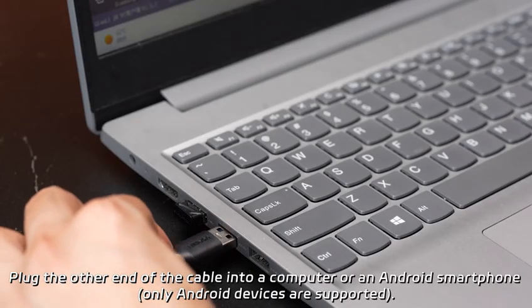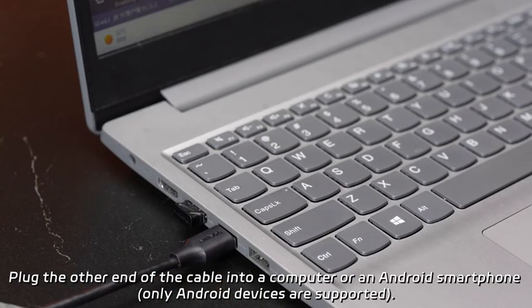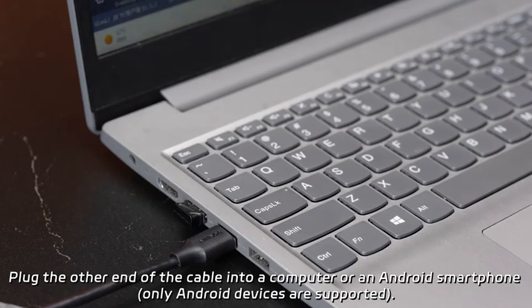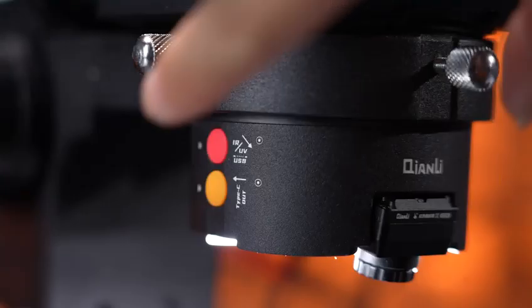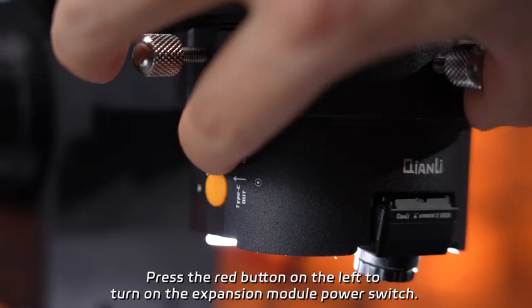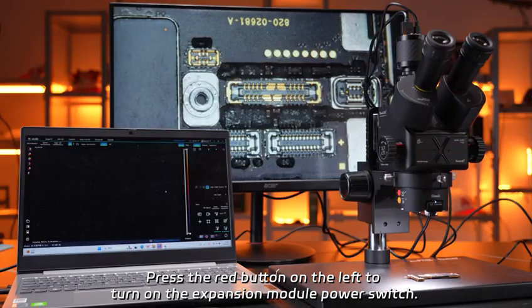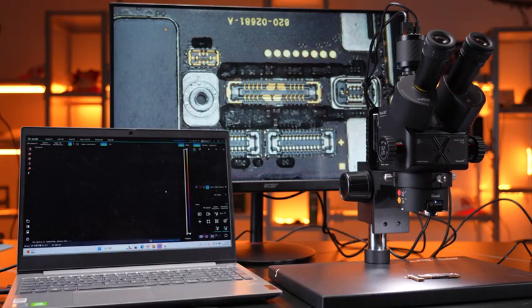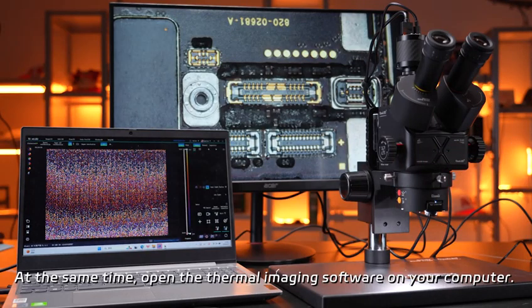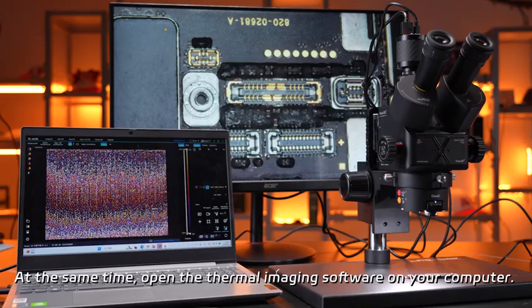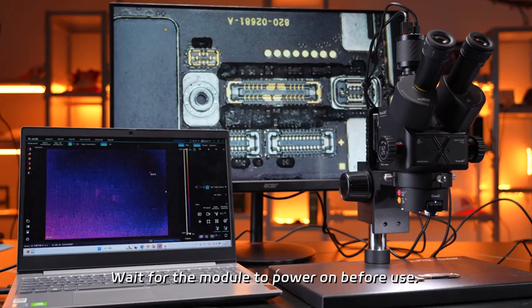Plug the other end of the cable into a computer or an Android smartphone. Press the red button on the left to turn on the expansion module power switch. At the same time, open the thermal imaging software on your computer. Wait for the module to power on before use.